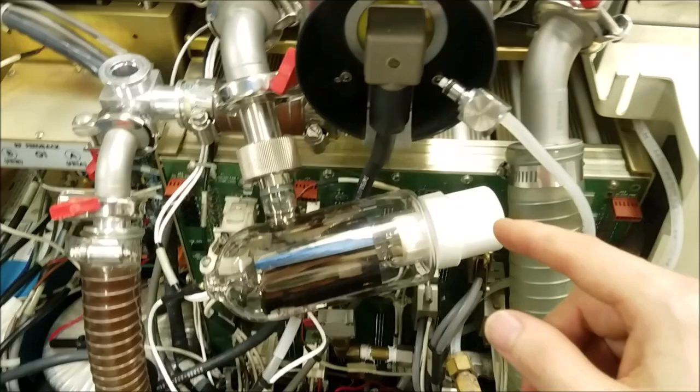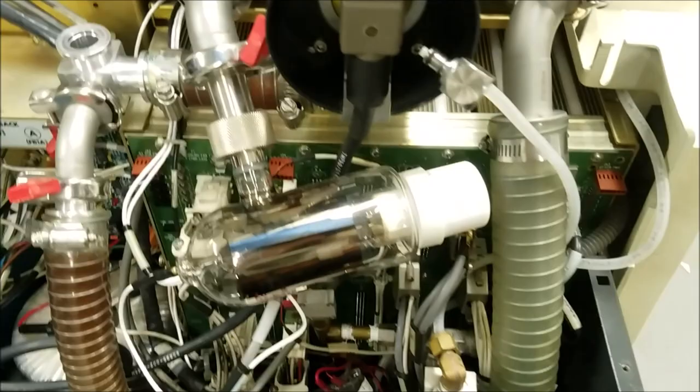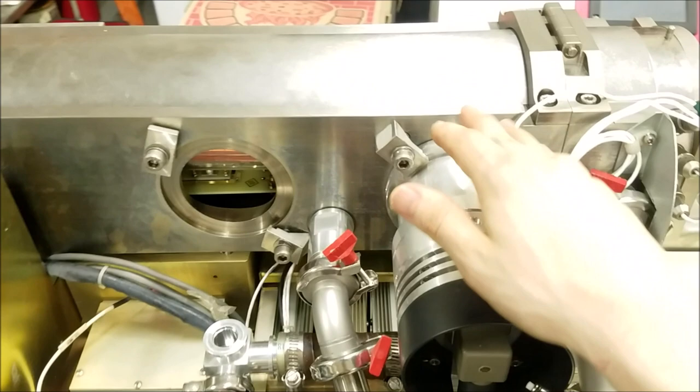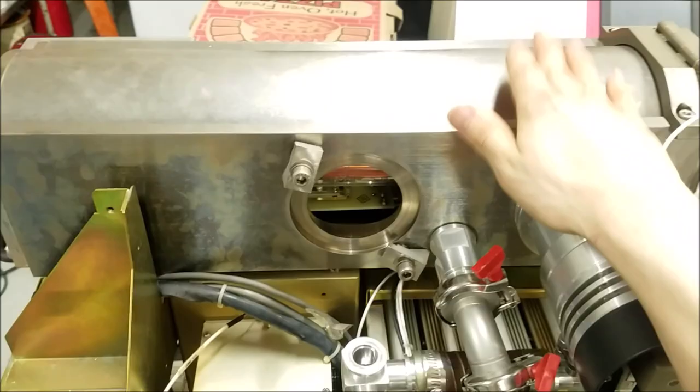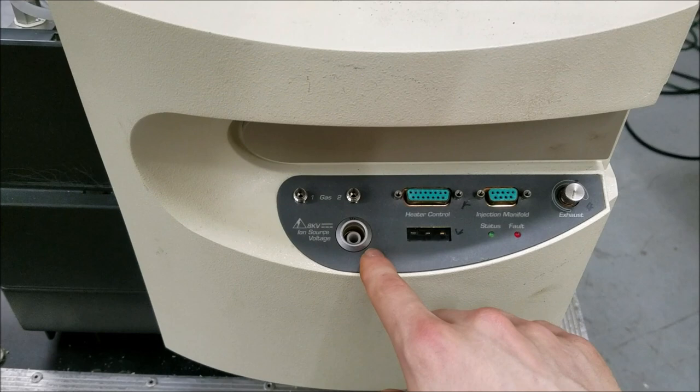We have here the ion gauge, which basically lets us know how much gas pressure is still in the system. We'll get into how this works later in the video, but the first things I have to do are disconnect this section, pull the ion gauge, and pull the turbo molecular pump so we can get a good idea of what's going on inside the upper test chamber. It's a very cool device.